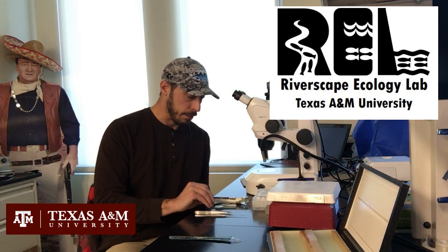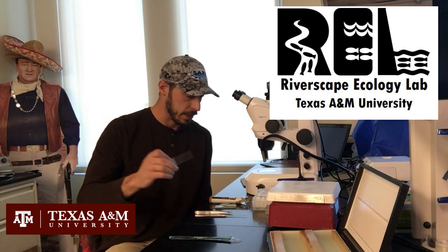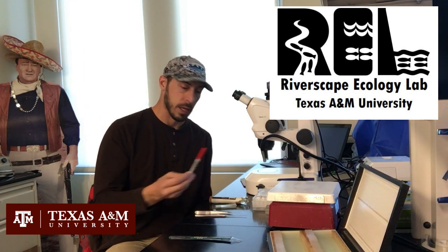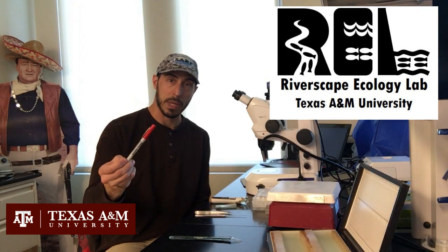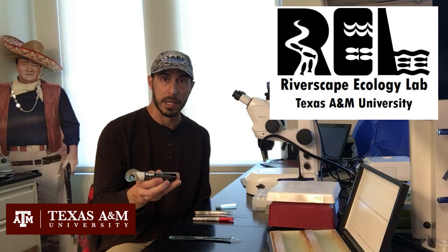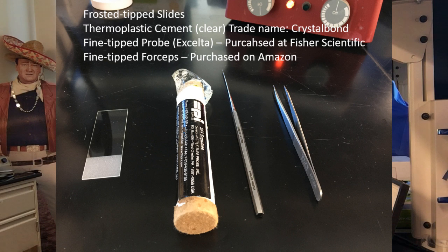You also need some microscope slides. I like to use the frosted tip slides — they're a little easier to write on the edge, which reminds me you need a fine-tipped Sharpie. And then some kind of thermoplastic cement. The brand that I've been using for the last five or six years is this SPI Supplies.